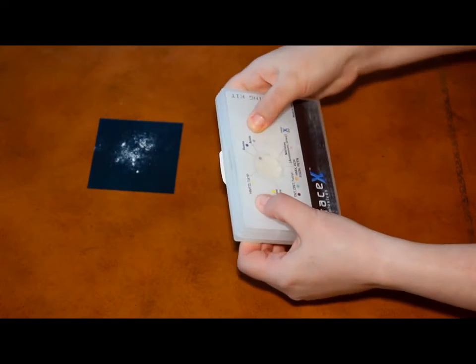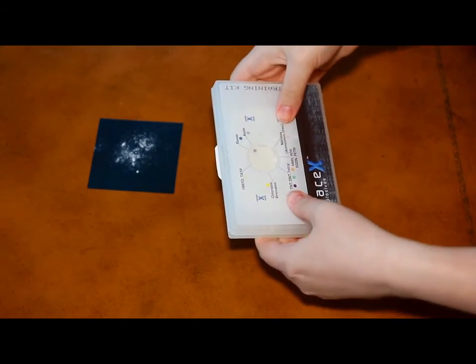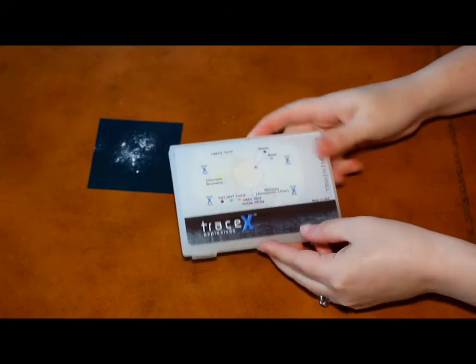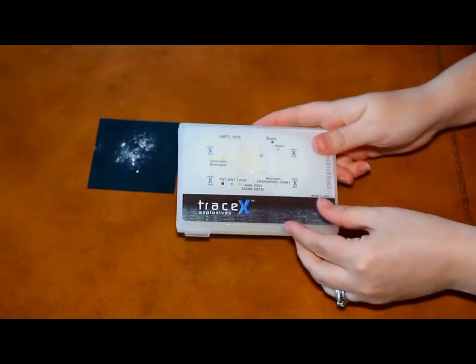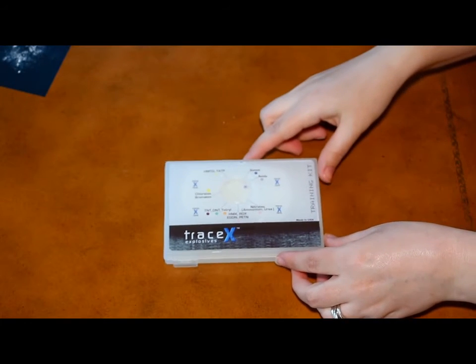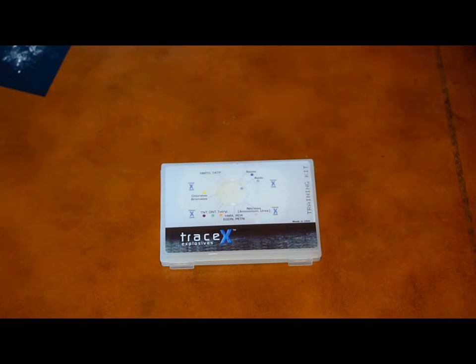To make sure you get accurate results, remember to not reopen the kit. While the kit is latched, gently shake it for two seconds. After you've shaken the kit, lay it flat for three minutes and allow time for colors to form in the window. Be patient — in cold temperatures, it can take up to five minutes for colors to form.